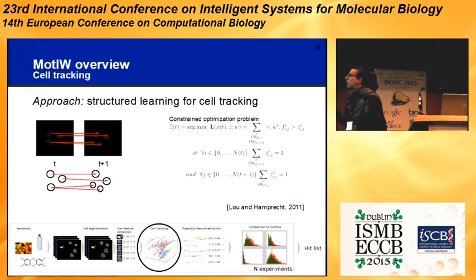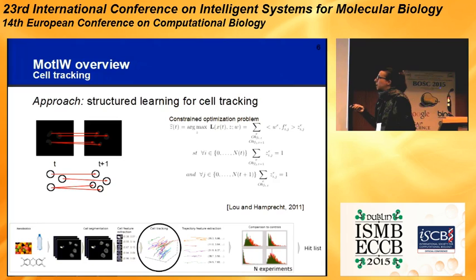Well, we have already identified all the objects in the consecutive frames. What we're going to do is enumerate all matching possibilities between the two consecutive frames within a reasonable distance and under the constraint that no one's left behind. And given this annotated set of trajectories, we're going to globally match the two frames, choosing the matching that's the most probable.